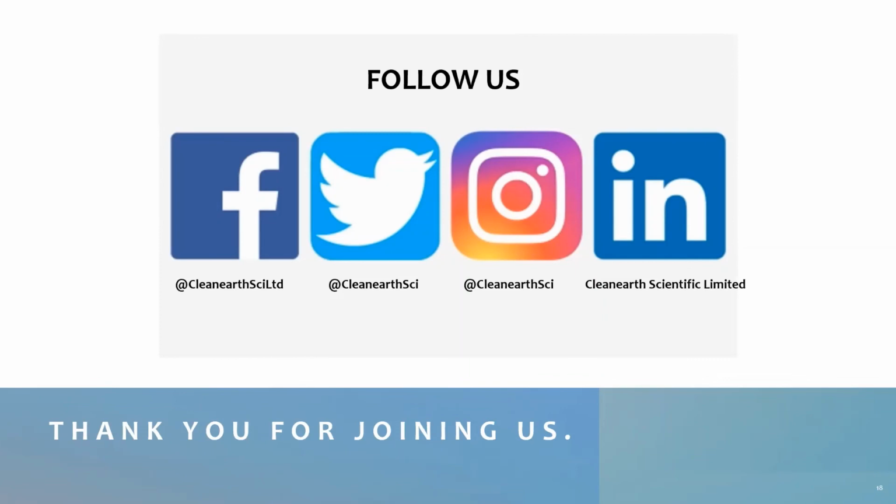Like I already mentioned, you have some cartridges to change, for example, ProGuard, or for those who have the Milli-Q Integral, the Quantum, and there is also the final application pack, or the final filter at the end. Either you have a Milli pack, a bio pack, or an EDS pack. Those are some of the consumables that you need to change based on which system you have in your lab. So it really varies from one system to another.